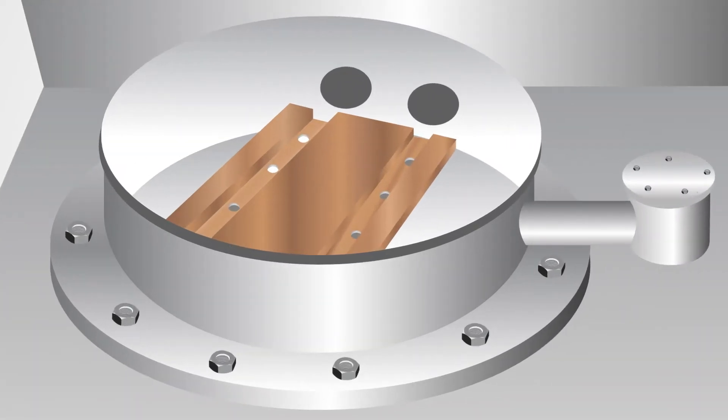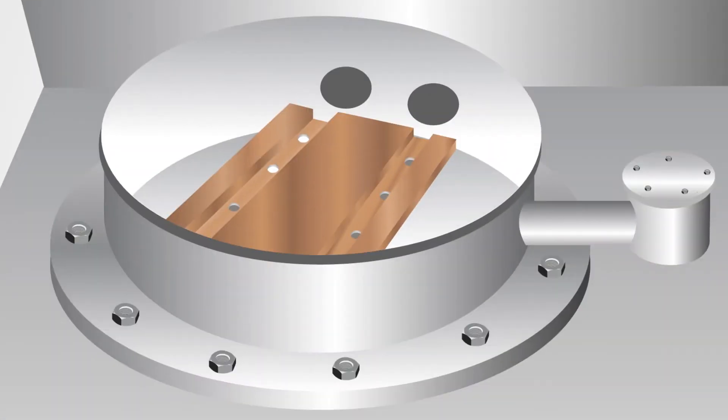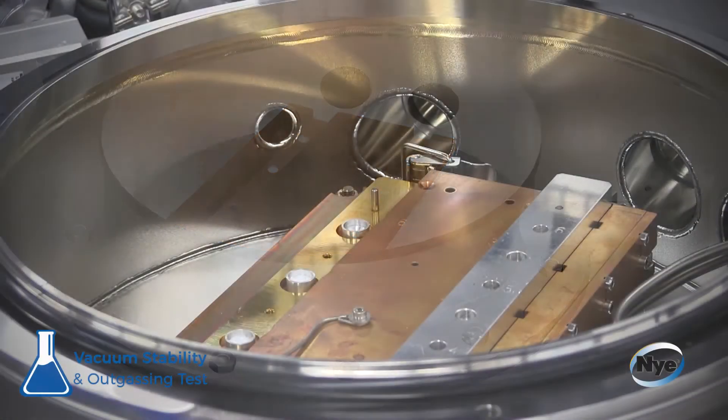A portion of the outgassing vapor leaves the samples. It passes into a collector chamber where some of it condenses on a chromium plated collector plate that is maintained at 25 degrees Celsius. Each sample compartment has a corresponding collector chamber that is isolated from the others to prevent cross-contamination.